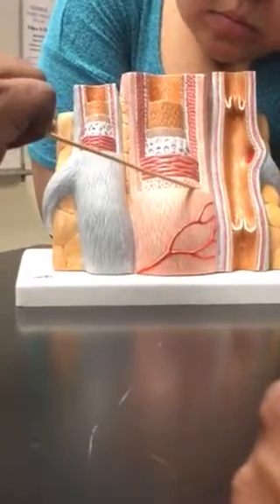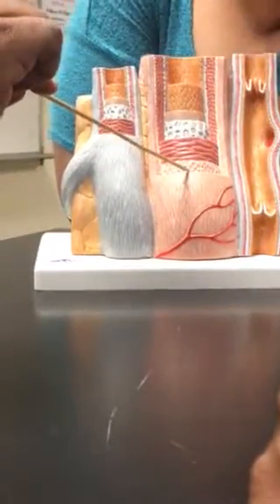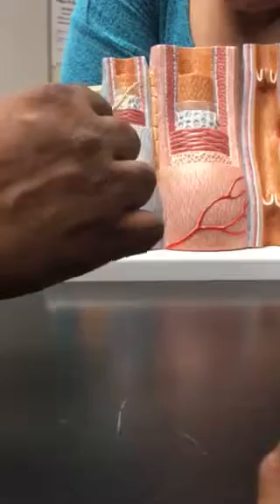And in the adventitia are these tiny blood vessels. They are called the vasa vasorum, and they provide all the necessary nutrients to the cells of the blood vessel. Okay, now let's look at the other one.